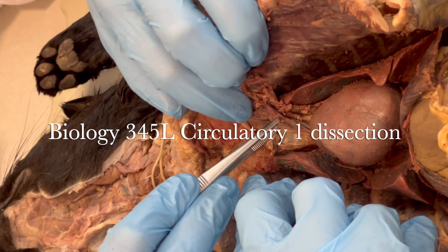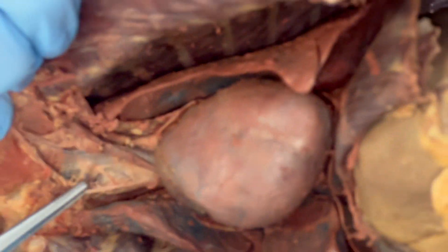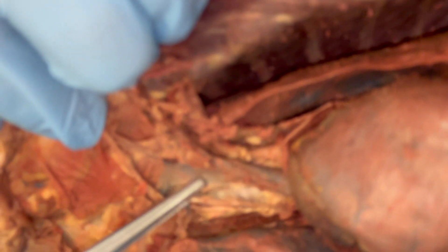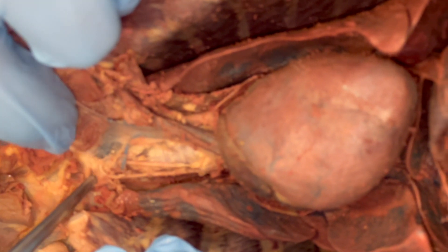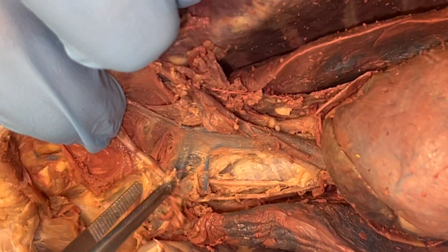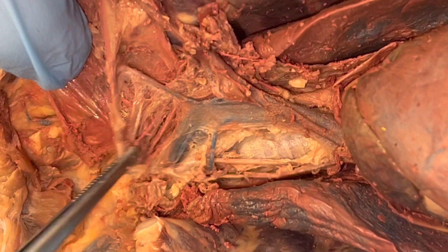For this dissection of the upper circulatory system, you want to start with the heart and start with the superior vena cava that you found on that previous dissection. That vena cava is going to be your guide today.